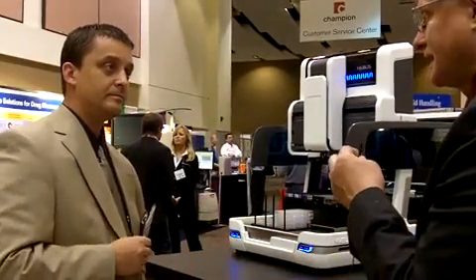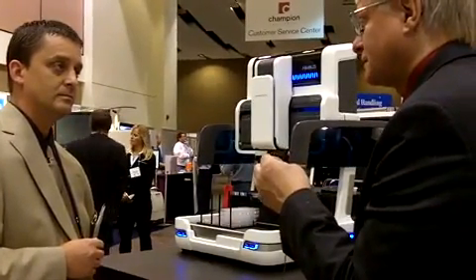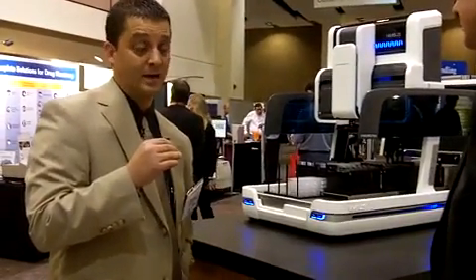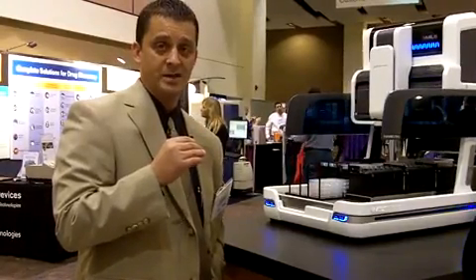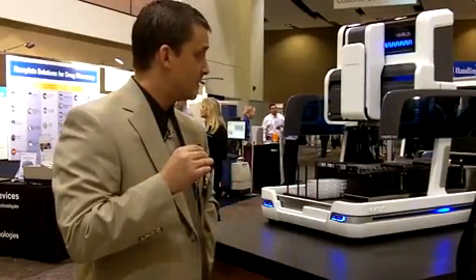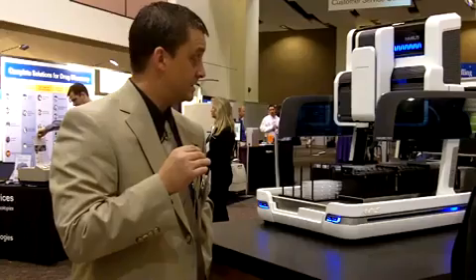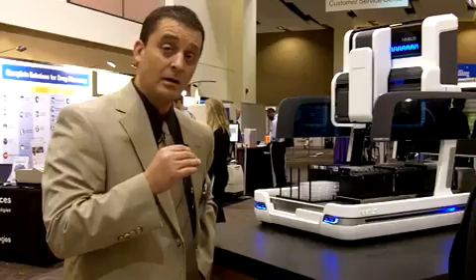Did it take your designers and engineers a lot of time and effort to overcome any challenges encountered in developing this? Well, there are always new challenges for engineers and R&D departments when developing a new platform. But Hamilton has a long history of expertise in liquid handling, and we parlayed that into this new platform. Fitting everything into a compact footprint was one of the biggest challenges, as well as maintaining the same performance as our larger platforms.